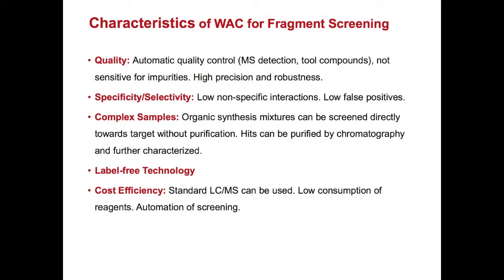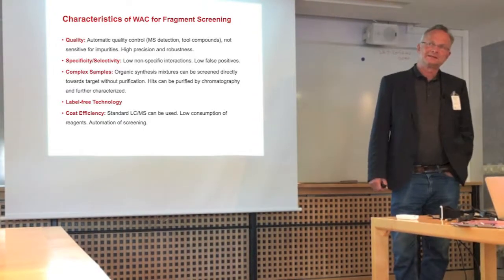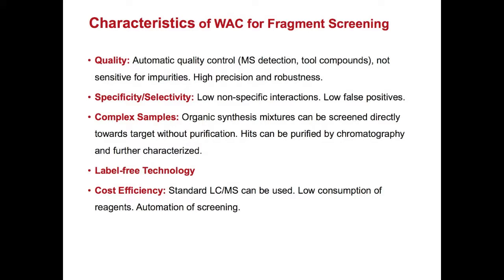Quality, this is LCMS. You now have good, robust LCMS, precision, accuracy. Remember from my old days with SPR and ELISAs, if I got a CV of 15-20%, then I was happy. Here you have HPLC CVs of 1 to 5%. Robust. And it's not sensitive to impurities because we have control of that.